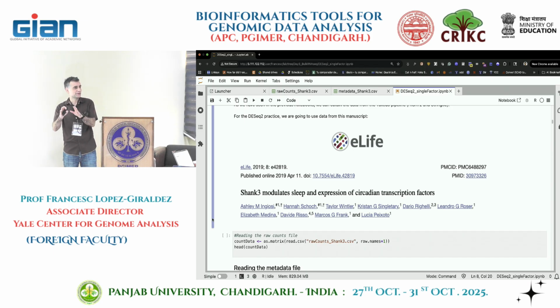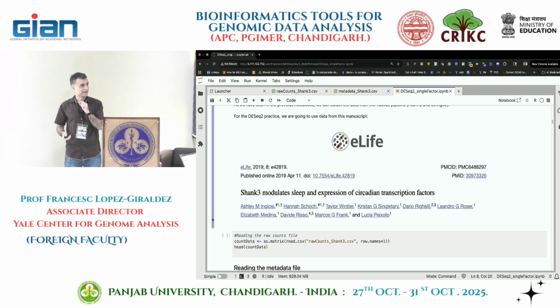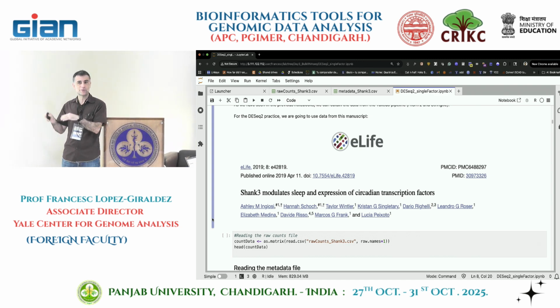We don't care much about the goal, so we're going to create our own goals in this analysis. But just to let you know, if you want to know details, the data comes from this paper. It's the original data they used in this paper. And you're going to notice we're going to come out with a different conclusion, not the one in the paper. I never went through the paper to know exactly how they did the analysis. I don't remember the details, but it's not the same results we're going to get. So I guess that happens in science.